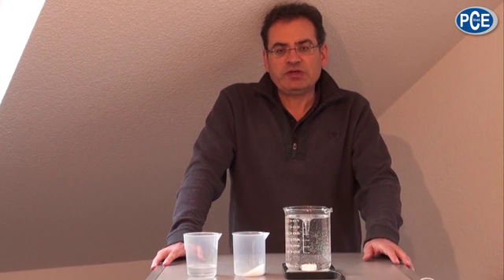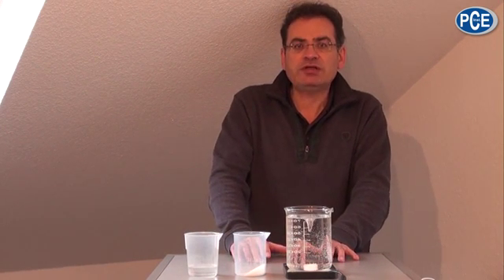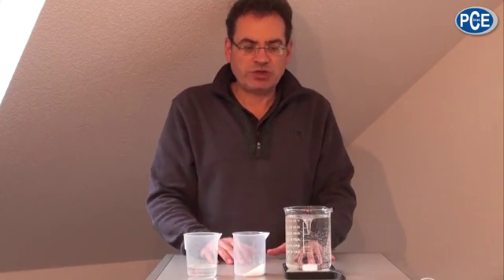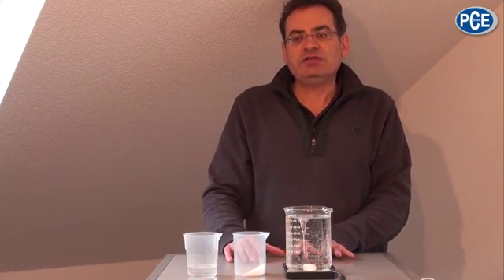Those are electronic measuring devices in different forms, with different measuring areas and different exactness, with or without a data logger, so a wide spectrum. Also to these pH meters belongs the sensor, and the choice of the sensor depends on what medium I need them for.